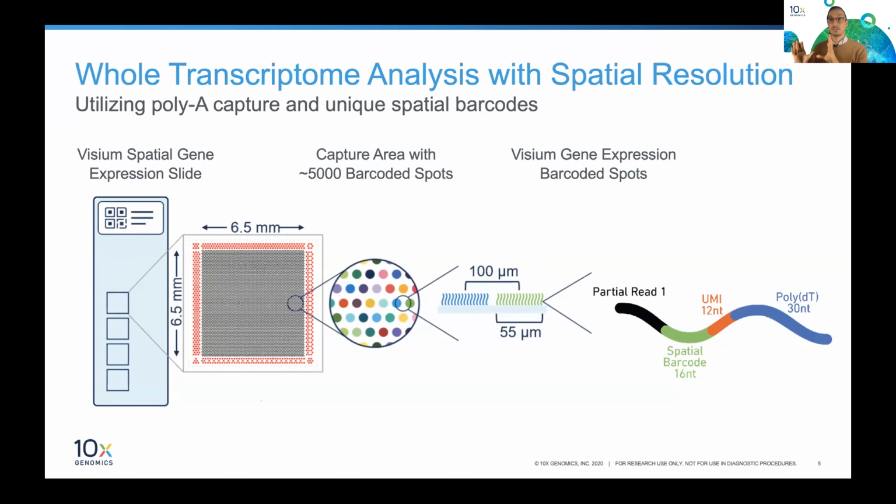That allows us later on, when we've done the sequencing and got the molecular profile, to actually put the molecular profile back on top of an image of your tissue section, an H&E stained or an IF stained image, you can choose that. And then you really can explore the data spatially.